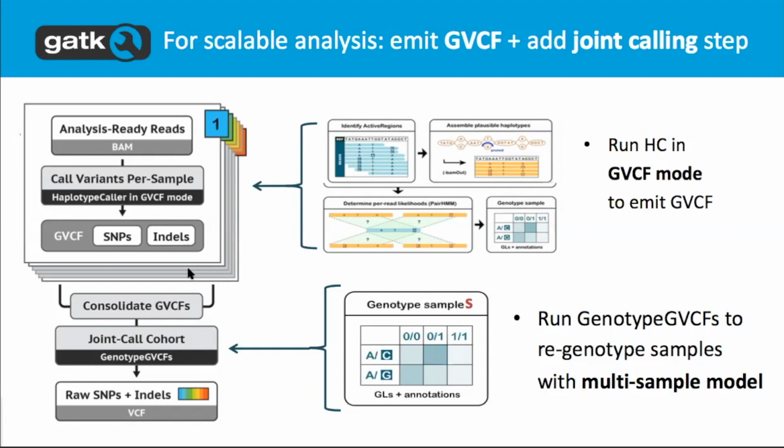Yeah, so in the areas where there's no evidence that anything is variant, we just don't call a variant. And we don't do any normalizations for those Phred scores that are untouched.